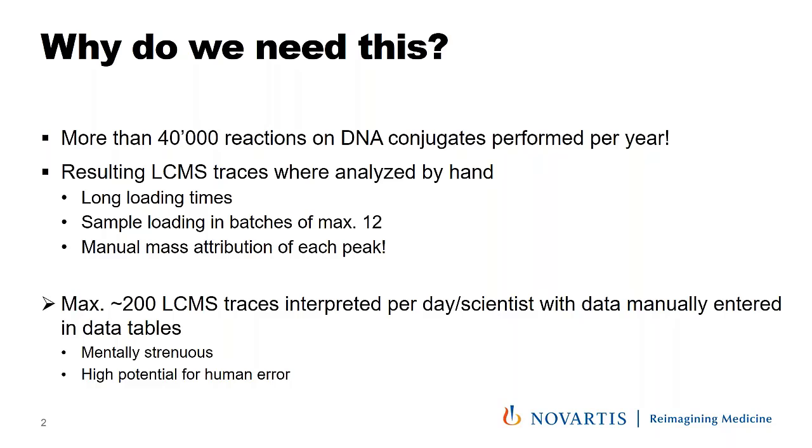And the results of all this analysis were then manually entered into an enormous Excel file, which was subsequently uploaded into our internal database. We were facing extremely long loading times, limiting us to a max of, let's say, 12 samples loaded at the same time. And this was leading to a very, very slow PC.